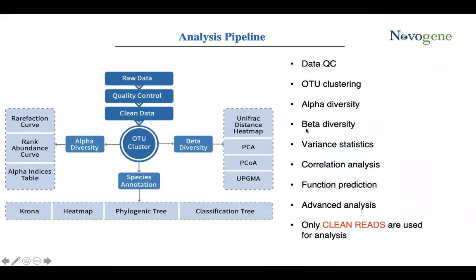And of course, aside from the analysis items here, we are also able to do some advanced analysis like the variance statistics, the correlation analysis, the function prediction using the clean reads we just got. And in the next part, I will walk you through these analyses individually.